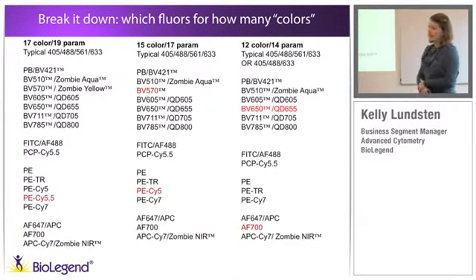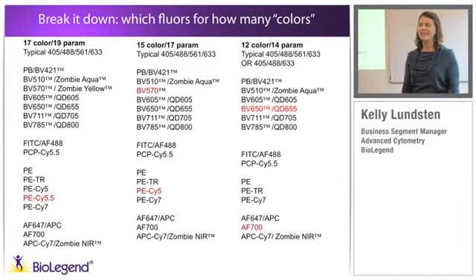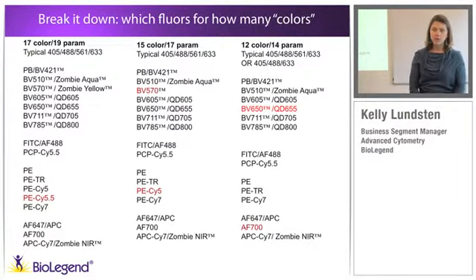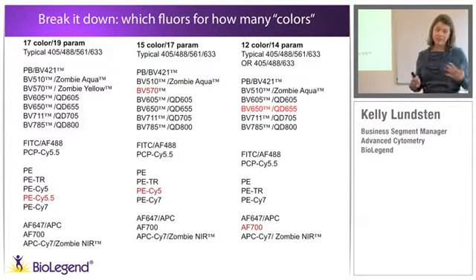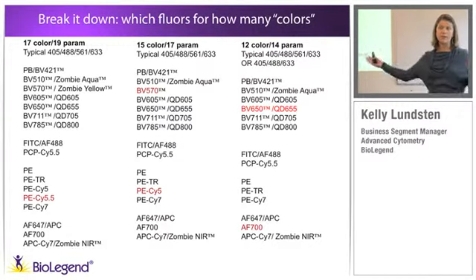All right, so the next 2 slides are probably my most requested slides on the planet. If you want them, you can contact technical assistance and we'll send them to you. This is actually my list of favorites. It's the logic that I use when I'm constructing panels for people. My expertise is the fluorophore chemistry, and with that information, this is how I would assess panels of different number.